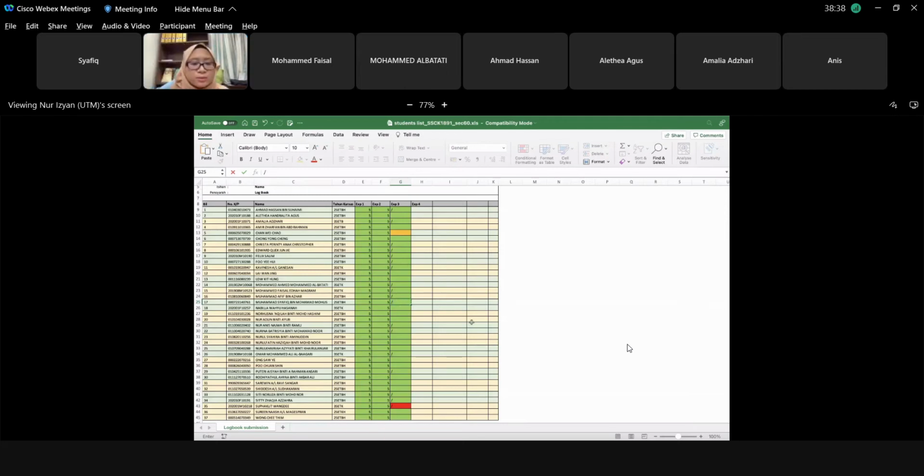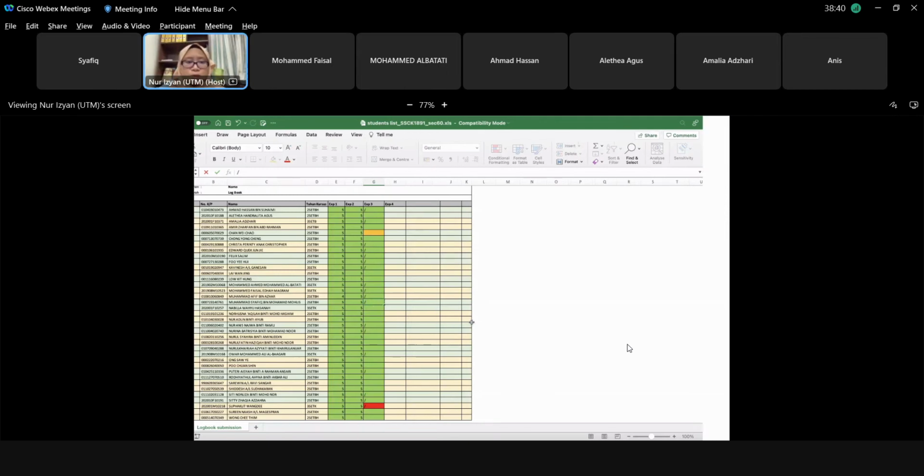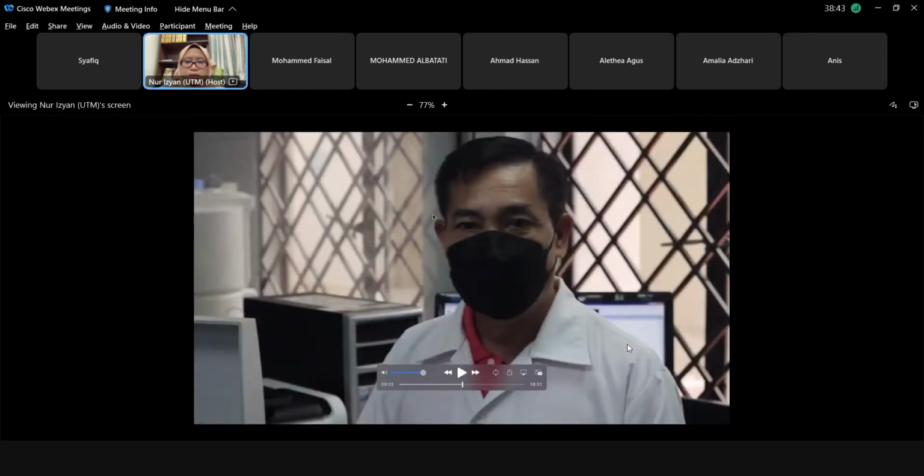Okay, now I think we can resume the video. But this video is in Bahasa Malaysia, I think. It has been recorded in Bahasa Malaysia. So for those international students, maybe you can ask your friends to help you translate what this technician describes on the AAS system. Okay, now he will be explaining how to operate the AAS machine.